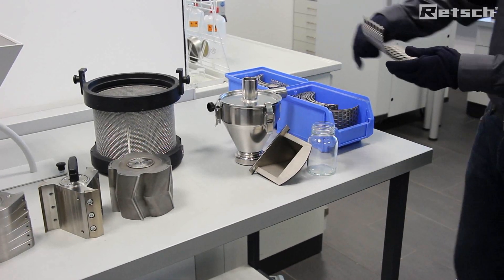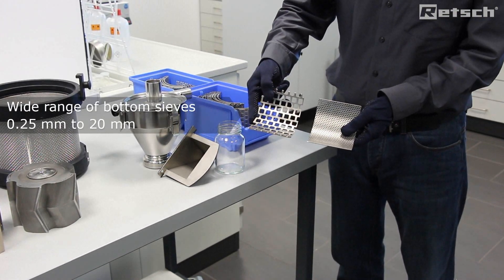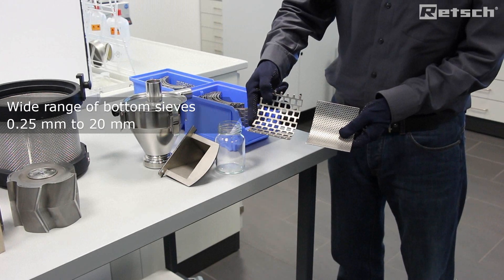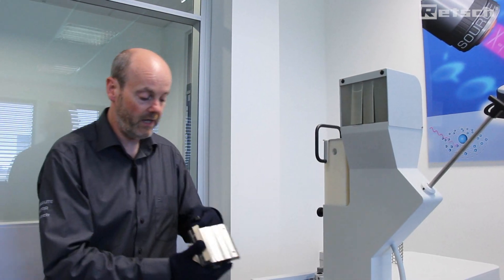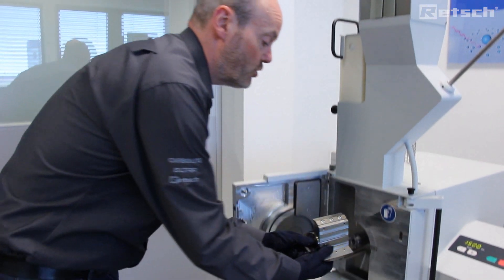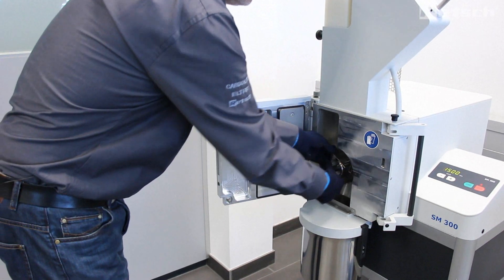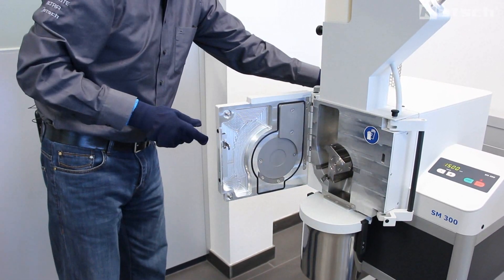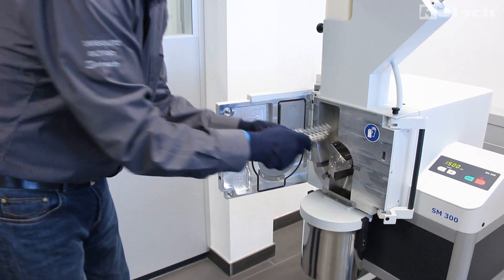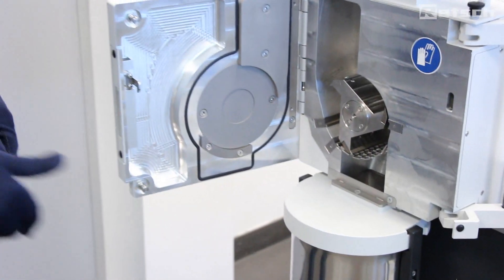Here we can see a wide range of accompanying bottom sieves. The maximum size aperture is 20 millimeters and the range goes right down to 0.25 millimeters. The rotors can simply be inserted using the rotor extraction tool and the bottom sieve of the right aperture can simply be inserted like this.